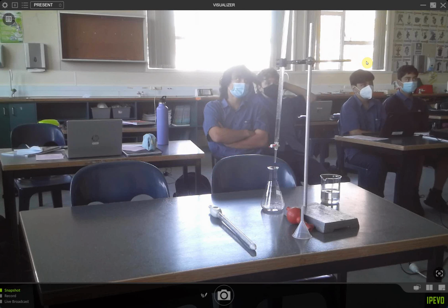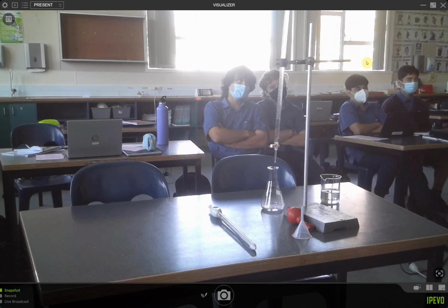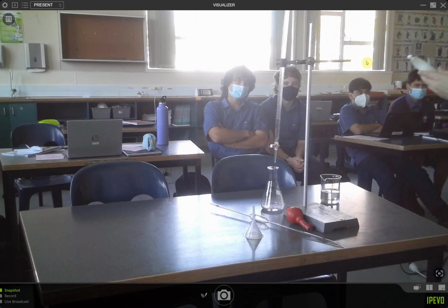I've seen that plastic one known as a dropper as well, but it's the same idea, just a bigger version of it. Those pipettes go up to 2 mLs. This one goes up to 25. That's the only thing that's really different about them. With these, there are some choices. There's this one here. These come in different sizes, but the downside is it only does 25. This one here, I actually haven't seen before. My previous one didn't have them, but they're more accurate to what you would be using in the lab. This one goes to 25 as well, but you have to measure against it.